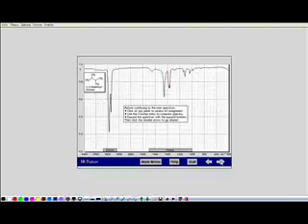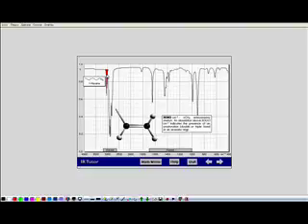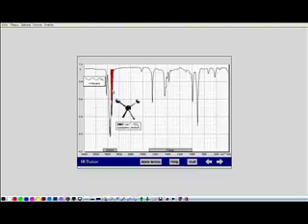Now what happens when we get to a carbon-carbon double bond? Well, when we get to a carbon-carbon double bond, what we begin to see are peaks just above 3,000. This peak is at 3080. And so what you see there is now you're seeing the sp2 CH stretches. The sp2 CH stretches are just above 3,000 wave numbers. Now it doesn't matter whether it's just a double bond, or whether it's an aromatic ring. The CH stretches are usually just above 3,000. And so you can see this asymmetric stretch, they say, is at 3080. I think there's another one that's just at 3,000, the symmetric stretch. And then after that, everything else is just alkanes, because you get below 3,000, and there's the rest of your alkane molecule of the hexene.